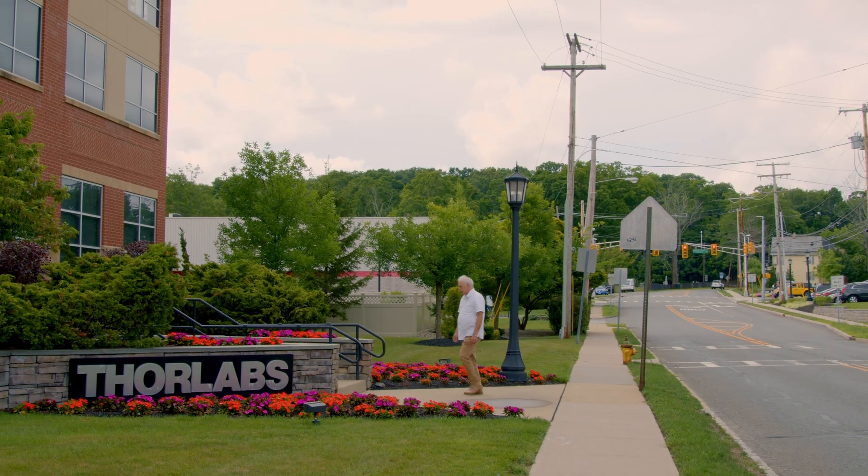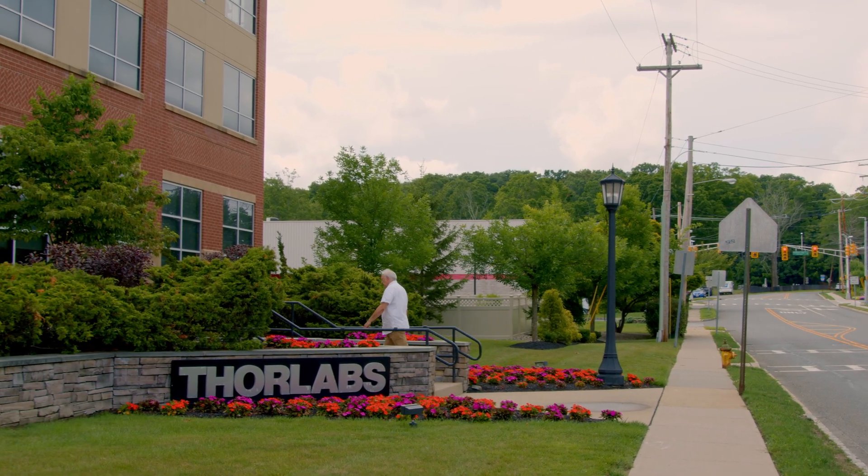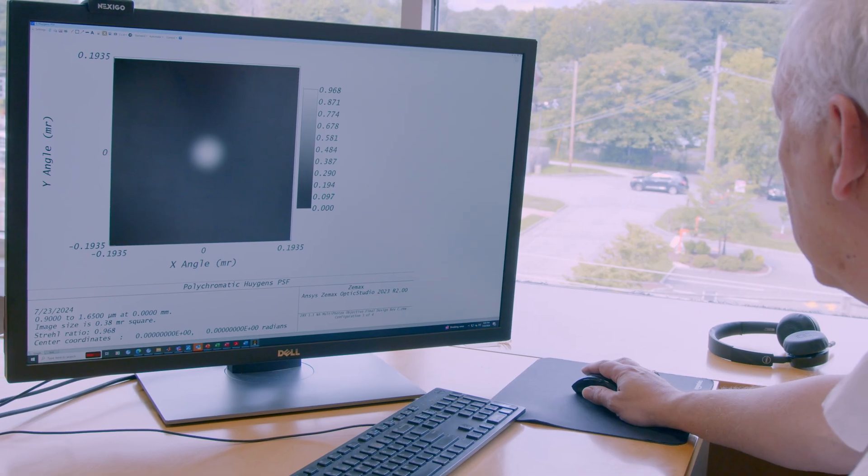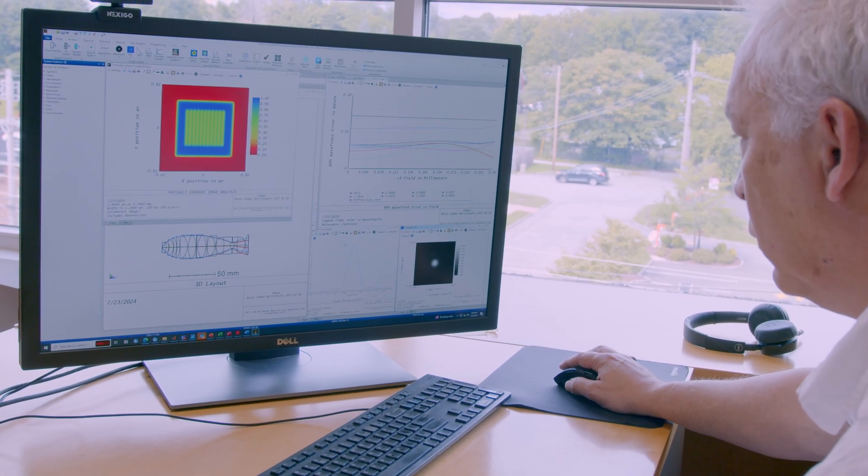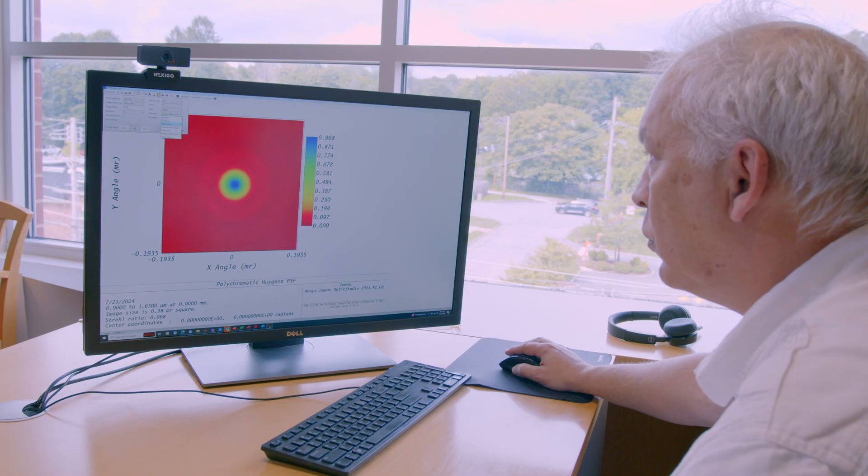When I started at Thor Labs, my main directive was to begin offering microscope objectives, tube lenses. I think the main thing I brought was that there is a way to get a step up from just aligning everything through mechanical means — how to go to that next level, what kind of techniques do we have to develop, all the way back to the design. In terms of simulation, we do a lot more now just from getting involved with multi-element lenses, because it opened our eyes to things we didn't have in the past.